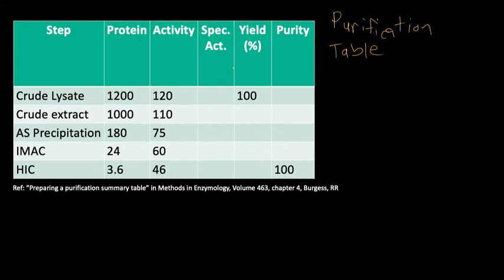This table was derived from this paper, at least the data I'm going to use today, "Preparing a Purification Summary Table," which was in Methods in Enzymology. So you can note where to look that up. It's got some more interesting information if you want to dig deeper.